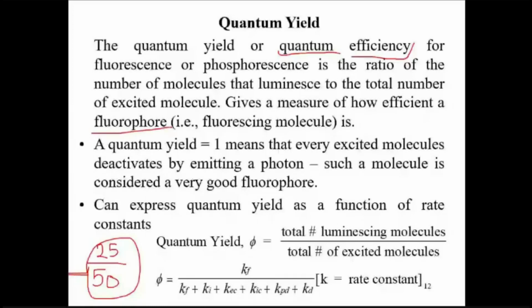Now, any guesses what the fluorophore will be? The similar word was chromophore. So what will be the fluorophore? A molecule that gives fluorescence. Acha, my question to you: if a compound has a fluorophore within it, can we call the entire compound a fluorophore or some part of the compound as the fluorophore? The functional group or part of the compound which is responsible for fluorescence will be called the fluorophore.